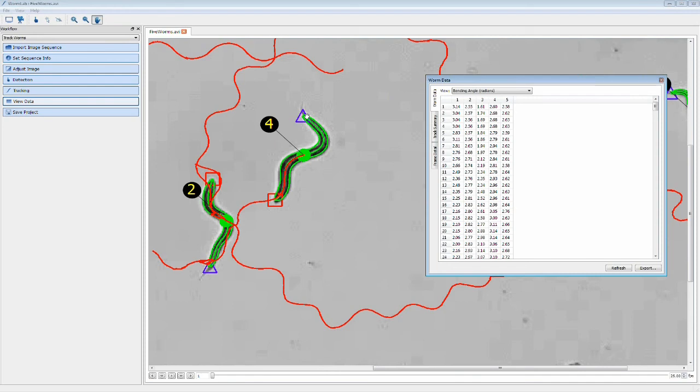So if the worm moves through different conformations, for instance, if it moves through an omega bend, the head and the tail tend to become, or the angle between the head centroid and central tail line becomes quite acute. It might reach something like 30 degrees, pi over 6 radians, and then we can detect omega bend using that information. We'll show you that a little bit later.